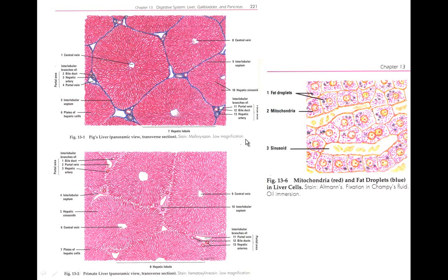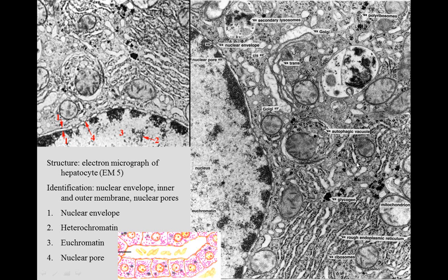We'll also look at the liver. Remember the liver has a lobule and they have cords of cells that go from here toward the central vein. We see one of those cords of cells and there's a nucleus of the cell. This is the nucleus in electron microscopic view showing the heterochromatin around the edge and the euchromatin all inside. Lots of euchromatin in the hepatic cell nucleus.